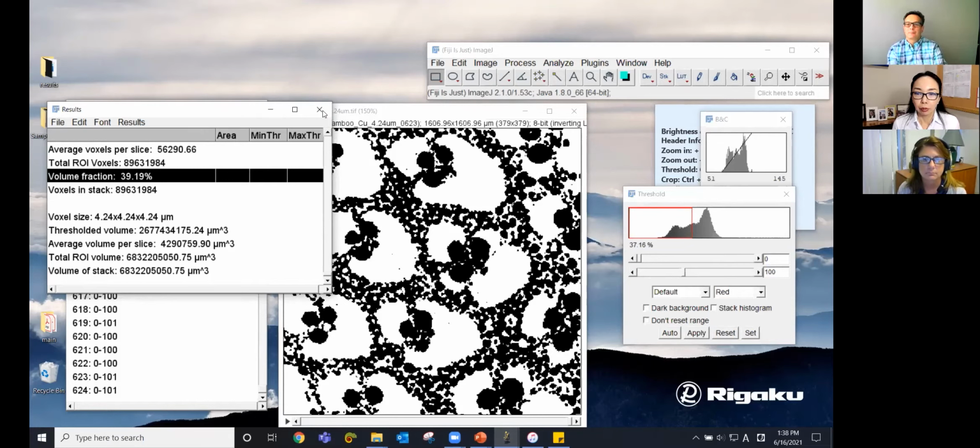Depends on, I guess you can just treat them as bad pixels or noise. You know, those little bits you see here and there, right? Yeah. So we will address it a little bit in the next scan in terms of reducing the noise level for the original image. So that's one way to reduce those dots or noise, if you can do that with the original image before you do the segmentation. Once you do the segmentation, then you want to reduce those little dots. You can probably do the same noise reduction. You know, those are averaging programs, so you can do that.